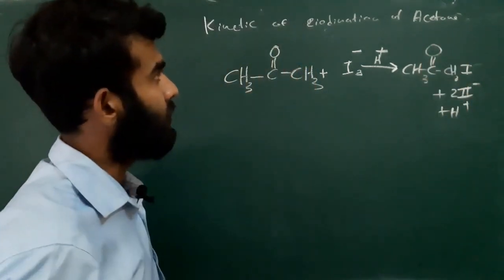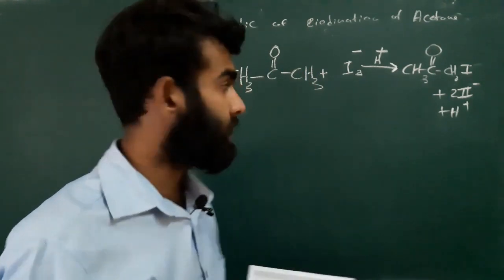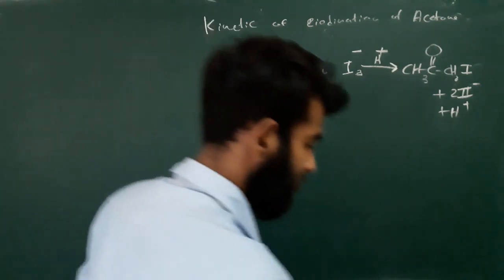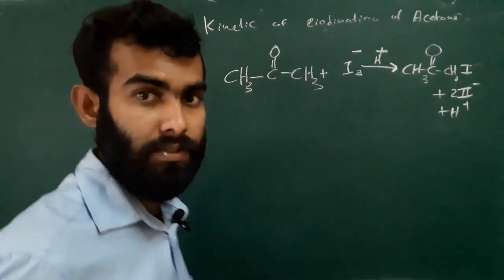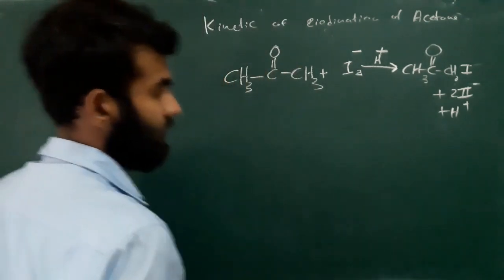This is the overall reaction of this iodination reaction. However, I am going to discuss the procedure and important steps.